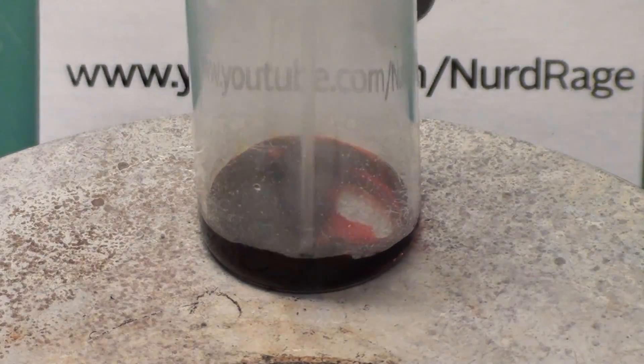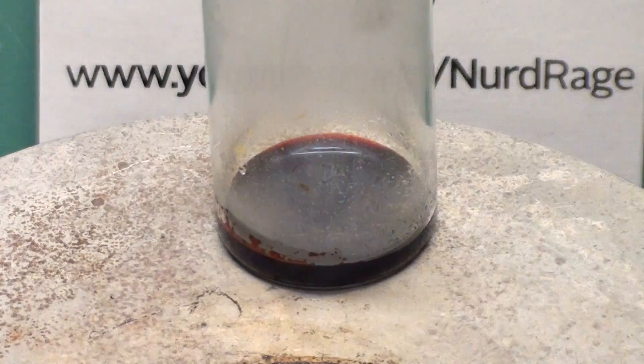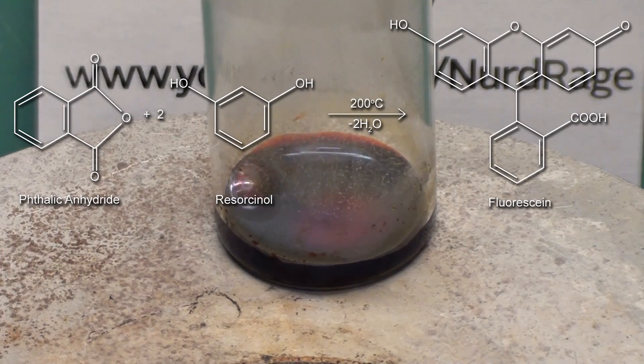You may have to stir it around a bit to get it mixed. Keep heating it at around 200 degrees Celsius for about five minutes. What's happening is the phthalic anhydride and the resorcinol are reacting to form fluorescein. The sulfuric acid is acting as a catalyst for this reaction.